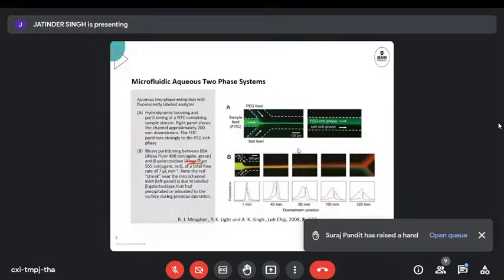So if one of the sides, suppose the salt side, stops for some time, then both sides will get separated at the other end. If you would stop the salt flow, so stop somehow, we are not stopping it, but stop somehow, then the separation will stop. So if you've got a blockage somewhere, we probably don't have separation anymore. So if we have a blockage here at this outlet, not in the beginning.